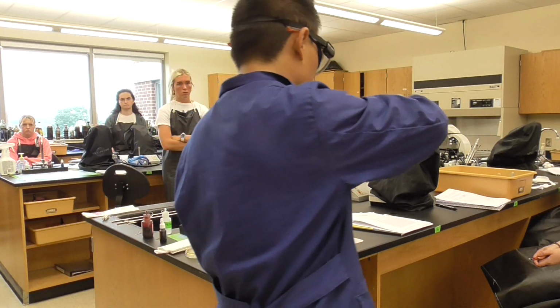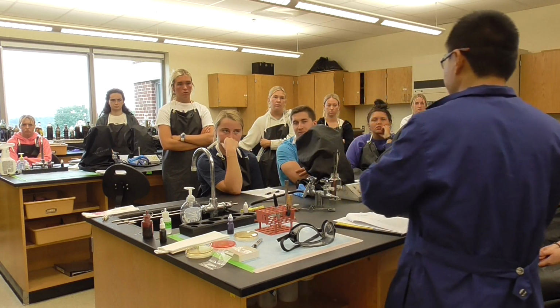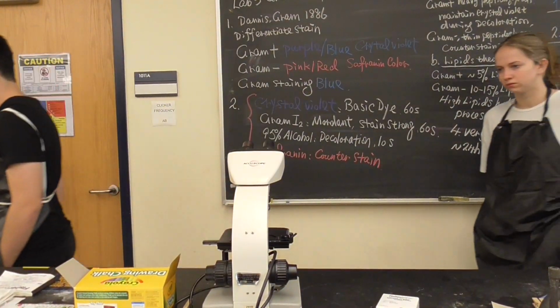I will tell you, I kind of feel very obviously that this E. coli might not be E. coli, because I already see the crystal violet staying strong. So we'll see what it looks like. Okay, now let's use the microscope. I'll use my microscope to see whether we can find it.